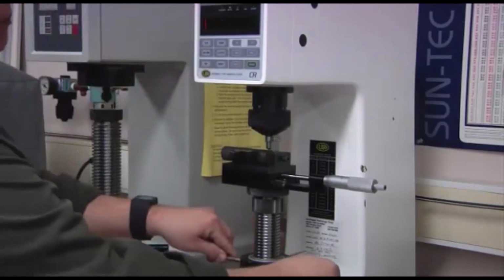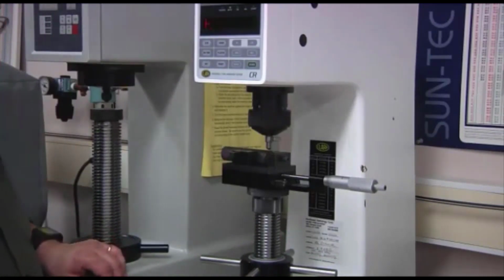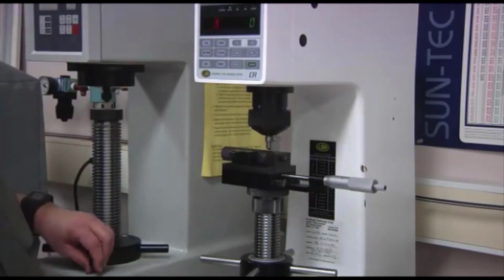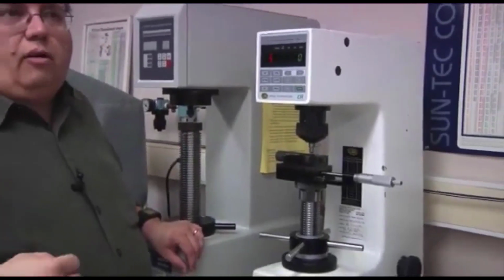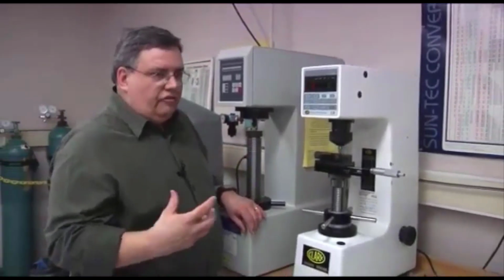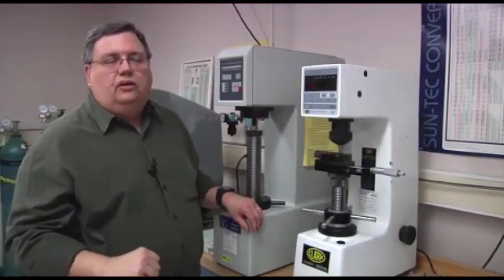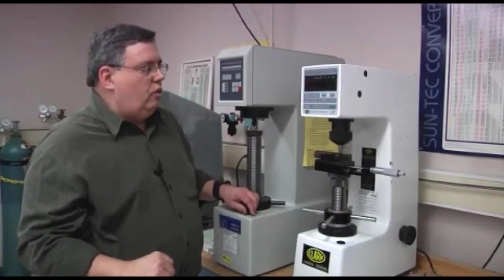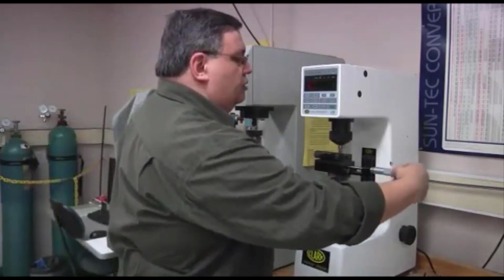And lower the specimen. The first two measurements are 2 revolutions apart. The next several are 3 revolutions apart. Then we go to 5 and finally 10 revolutions. That's marked on the bottom of the data sheet. Also, whenever we get 2 measurements that are below 20 in a row, we can stop. If you look at the figure in the presentation, right, the hardenability curve basically ends when the hardness drops to a Rockwell C value of 20. So now we have 3 revolutions.